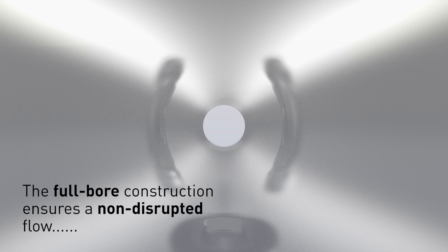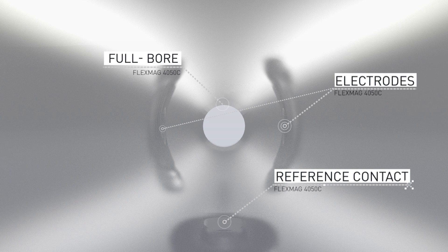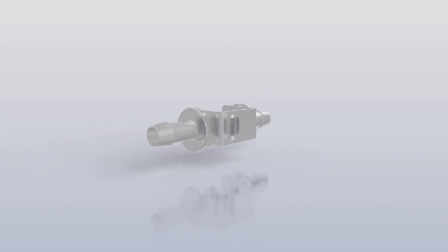The full-bore construction ensures a non-disrupted flow. As a result, there is no hold-up, pressure drop or obstruction of the fluid, and unlike other technologies, the molecule structure has no risk of being harmed.